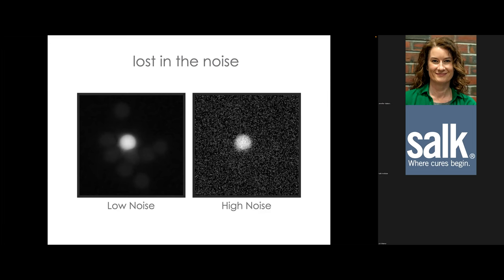Here, two populations of fluorescent beads — one very bright, one much dimmer — illustrate how noise affects detection. The image on the left has a high signal-to-noise ratio and we can see both populations. In the image with lower SNR, the weak-intensity beads are lost in the noise — the variance in intensity due to Poisson noise is greater than the bead intensity itself. This is not a resolution problem; those beads didn't disappear because of the diffraction limit.